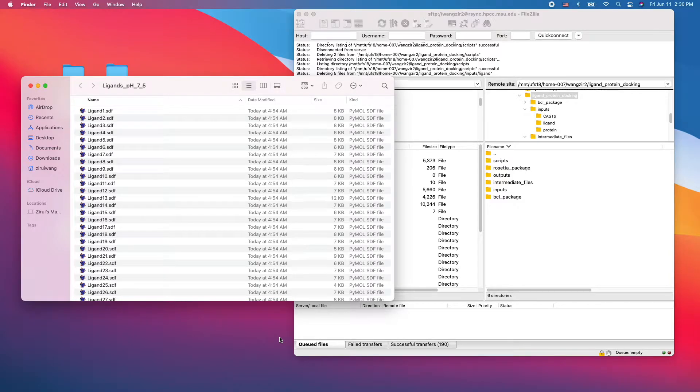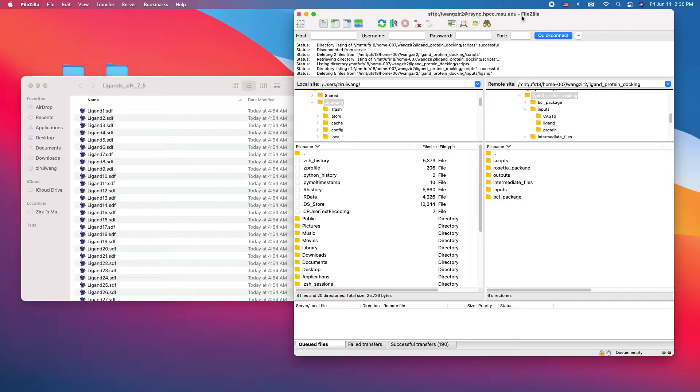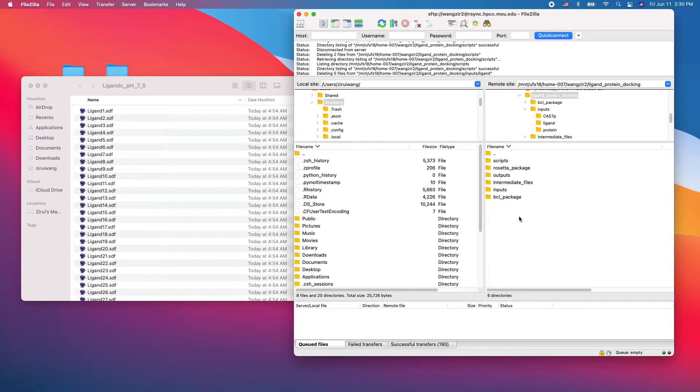Alright, I have my ligands ready. They are all at pH 7.5 and I'm going to use FileZilla to transfer my files into my HPCC account.